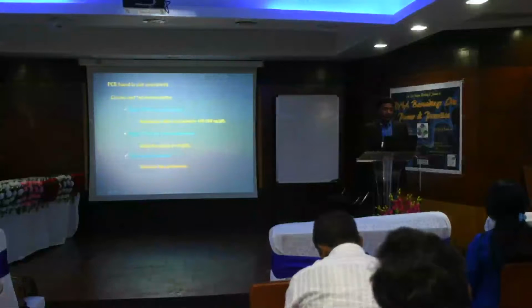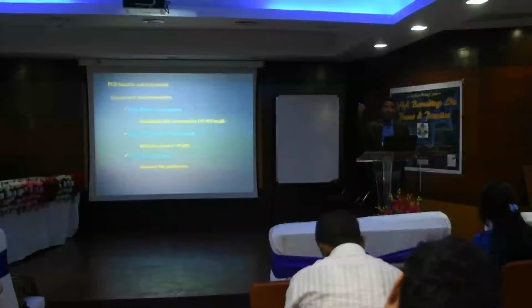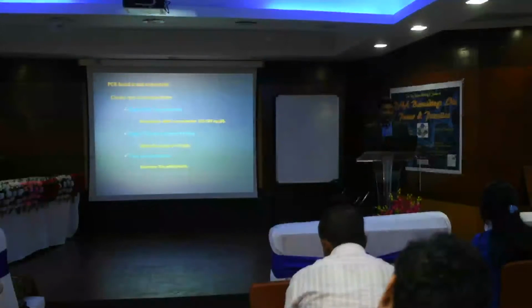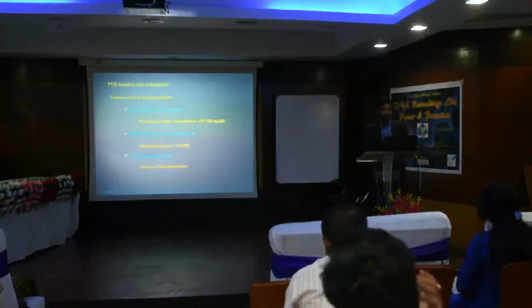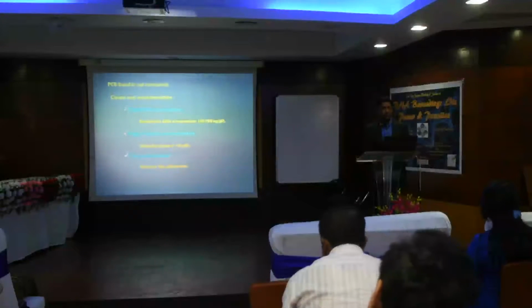Your pipetting handling and solution handling is not good. Moreover, high DNA concentration is essentially there, that I was telling you. You haven't recognized the pressure on the pipette while dispensing and aspirating. So standardize the DNA concentration here. High primer concentration can also be the same reason. So primer dilution should be up to 10 picomole.